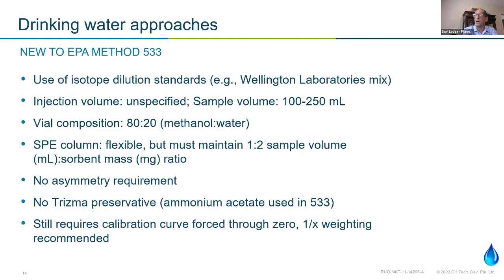It allows the analyst to get a more accurate measure of the effect of the extraction and the sample prep on the analytes that are being looked for. And it allows you to get a more accurate and more sensitive method of detection and quantification versus just using internal standards.